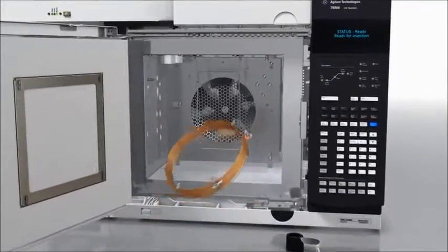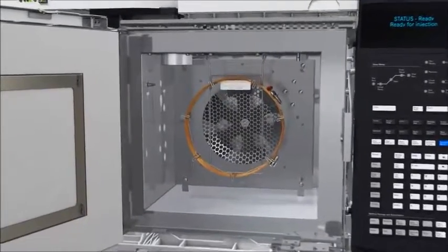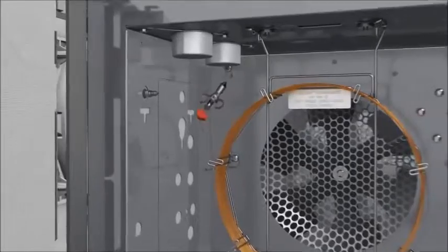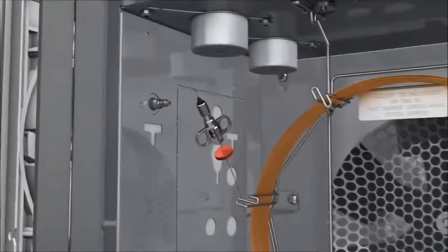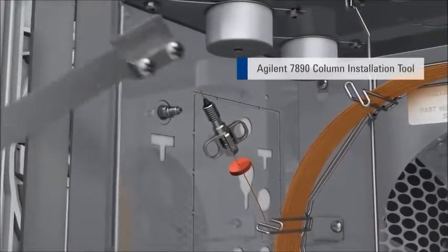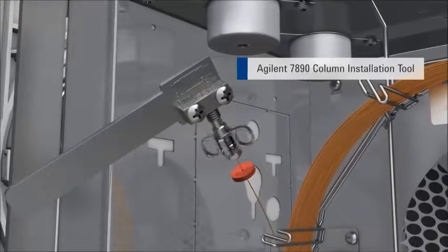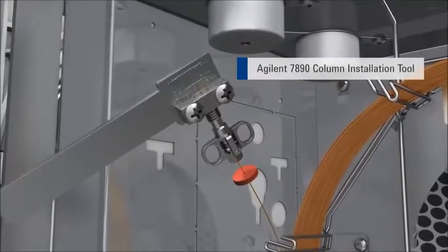The height or length of the column in the inlet or detector impacts peaks and results. For the 7890 splitless inlet, 4 to 6 millimeters is recommended. A column installation tool to pre-swage the ferrule onto the tubing improves consistency.